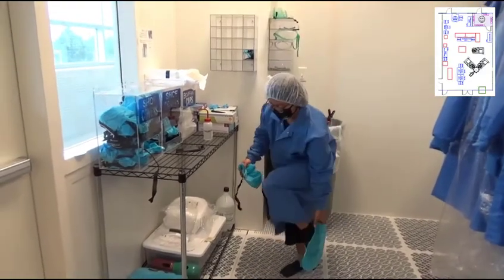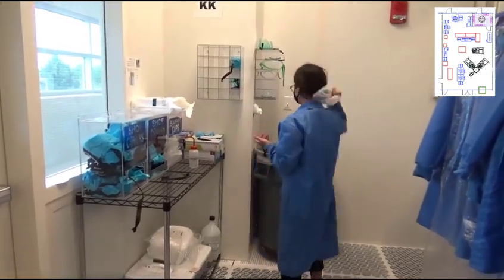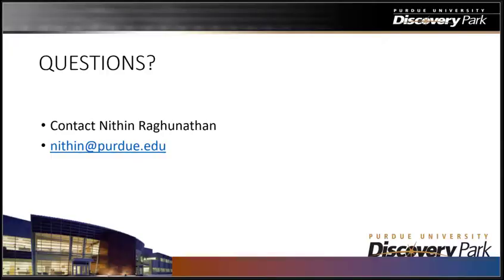When you are ready to leave, hang up your lab coat in the gowning room and place your shoe covers and safety glasses, if applicable, into the cubbies. If you have any questions about the J-Bay facility, please contact the staff member in charge of this area.